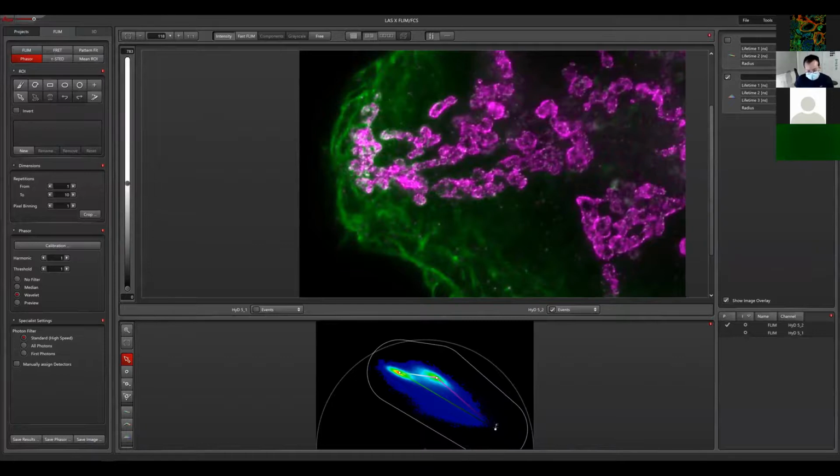And one thing that might maybe be improved in the future, and this is something that maybe we can discuss with Leica, if they want to implement it, is if we can have some play with the linearity of the intensity between the 2 points. So if we could play between the 2 points instead of just doing a linear increase or an exponential or a log one, then we might be able to unmix better and deal better with these small artifacts that we can see here.